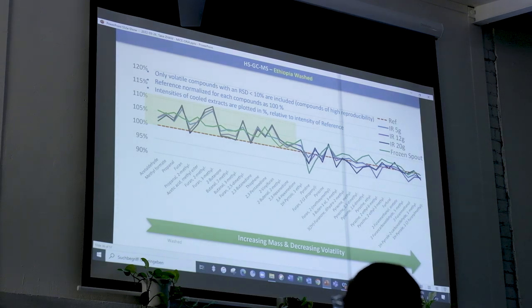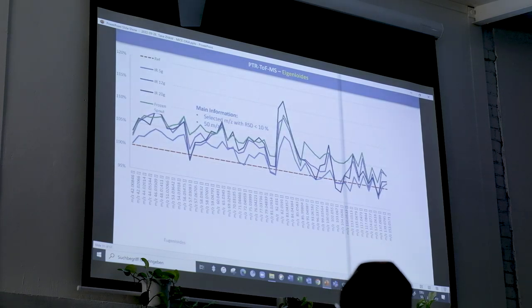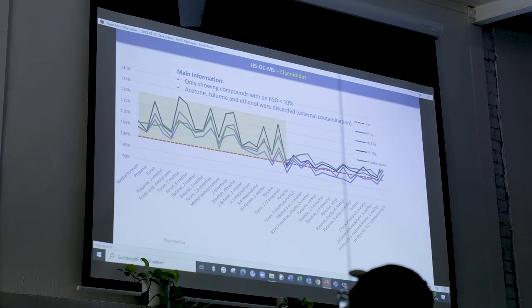Now, we tried the second coffee, and exactly the same phenomenon, a systematic increase, depending on the three conditions that we have. Cooling increases the intensity of the compounds above the cup. Here, the percentage is a little bit different. It really depends on the coffee, and there's still a lot of work to be done. Also, with gas chromatography, you see that the early compounds are selectively increased compared to the compounds that come later. This is the basis of extract chilling.